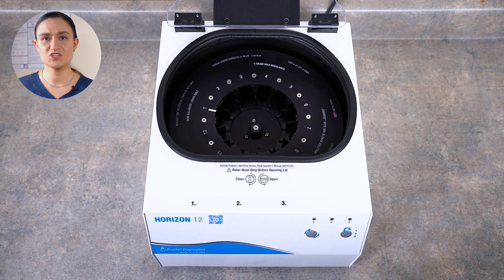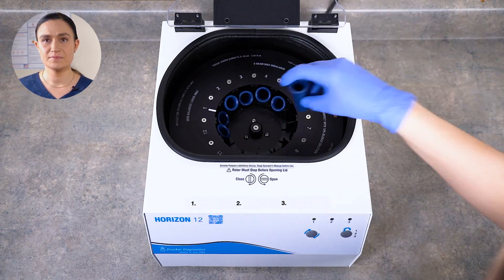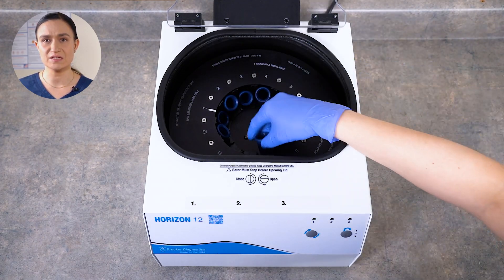Step 1: Make sure that all 12 tube holders are properly seated in the Horizon 12 rotor. They do not snap into place, but should be seated one per slot in the rotor.